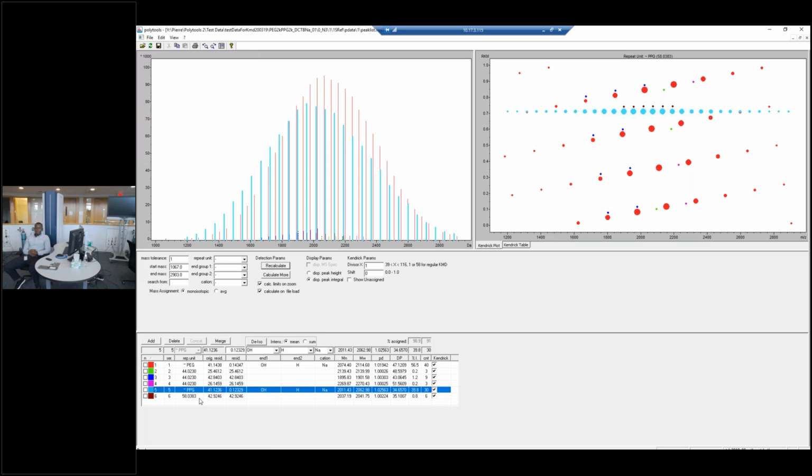Thank you. I think I will take the next question. Can you make demos showing how the various sample preparations are performed? For example, dry deposit, sandwich method, etc. Yes, I think that very well could be our next demo.